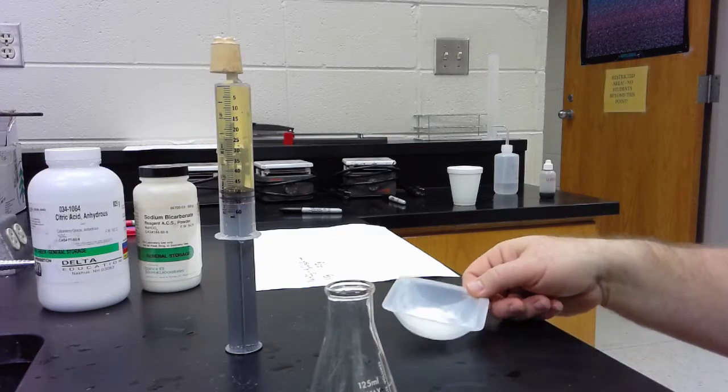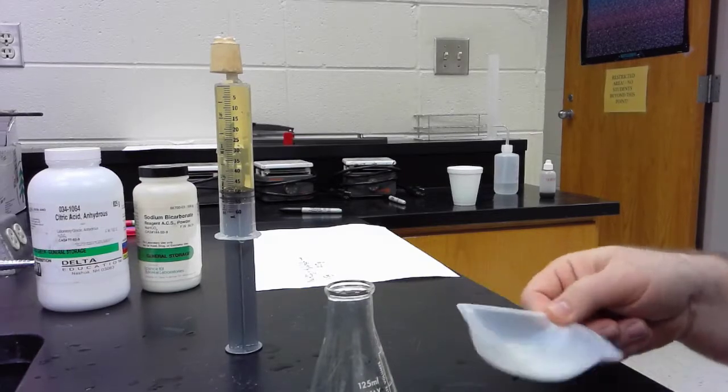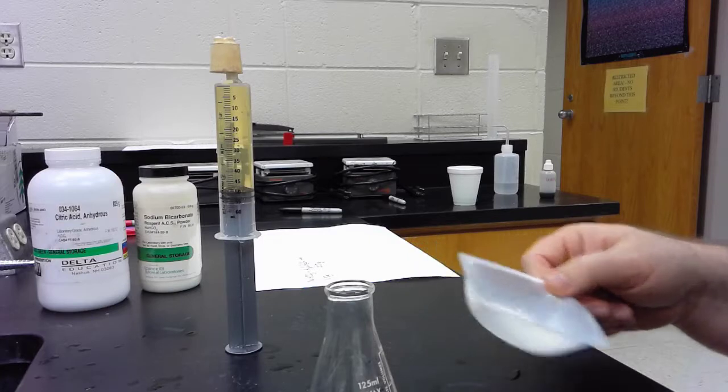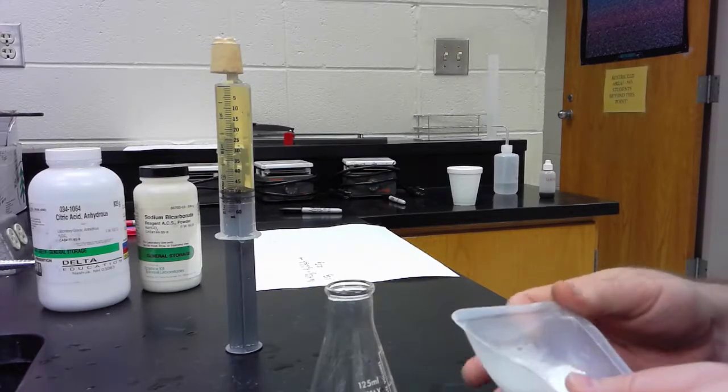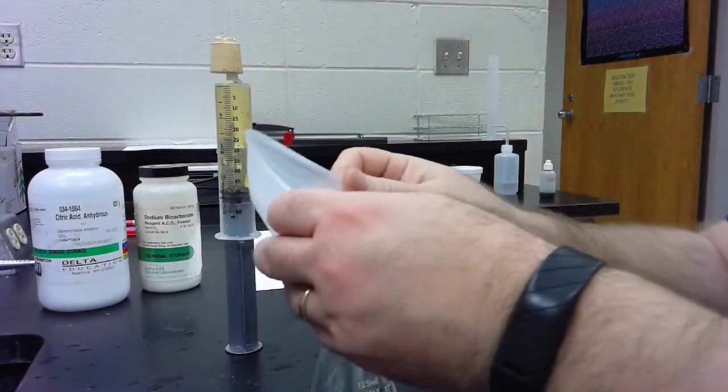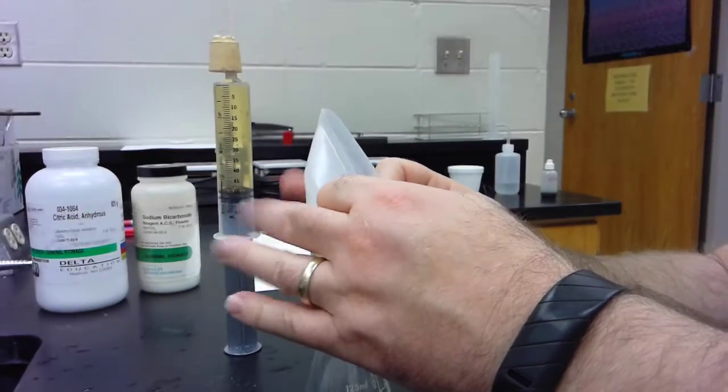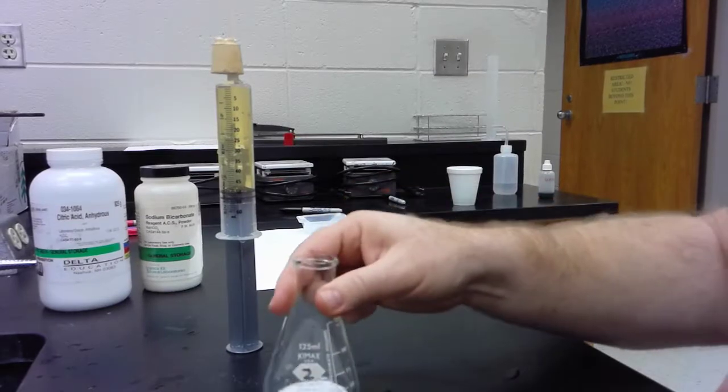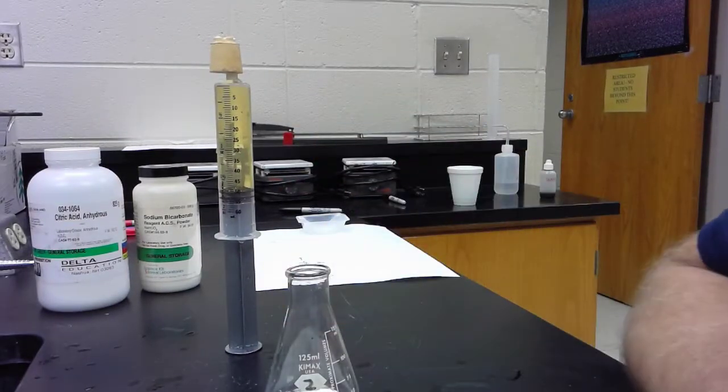I've made a mixture with half a gram of citric acid and one and a half grams of sodium bicarbonate. I'm going to put them in this little flask and I'm going to add some water from my syringe here. I've got about 50 milliliters of water.